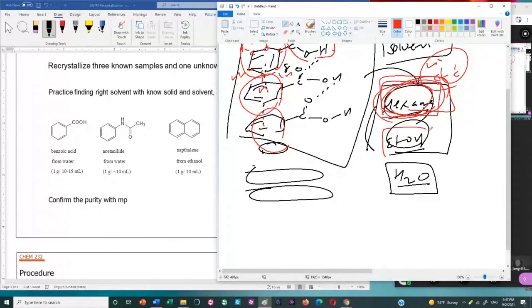Okay, then ethanol. Same manner we just did. Ethanol, you may not know, so I'm showing you CH3, CH2, then OH. 7 atoms nonpolar, 2 polar. 7 out of 9 nonpolar, 2 out of 9, about 20-some percent polar.